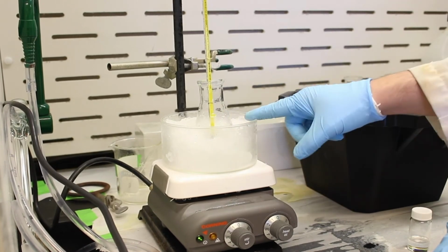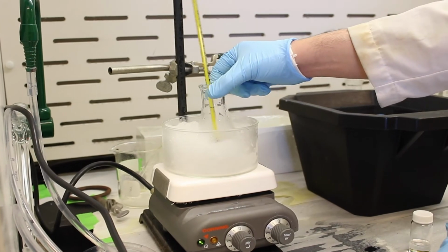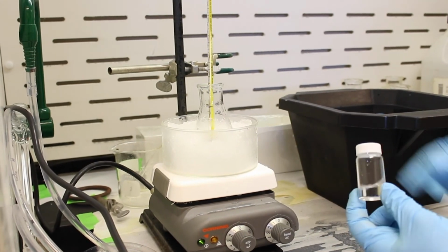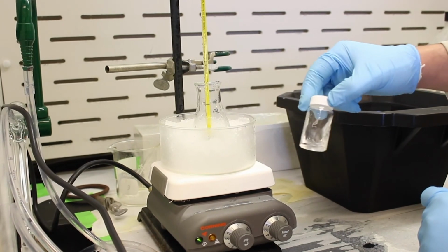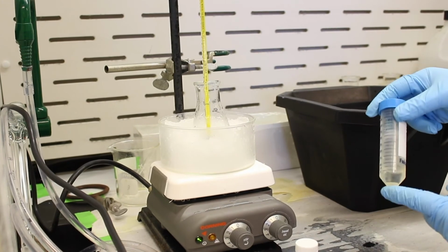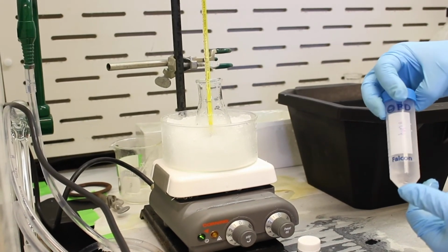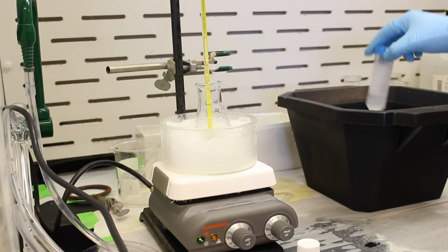So this is our reaction apparatus here. We have an ice bath because the reaction needs to be kept cold. We have an Erlenmeyer flask with a thermometer to read the temperature. We have a stir bar in there, but you can't see it. This is our starting material, our methyl benzoate. So methyl benzoate is a colorless liquid, so keep that in mind. And then here we have on ice some nitration mixture. So there are 4 mL of nitric acid in here, and it's mixed with a little bit of sulfuric acid. And then we have our solvent, which is sulfuric acid. So the solvent for this reaction is actually sulfuric acid. And they both need to be kept cold.